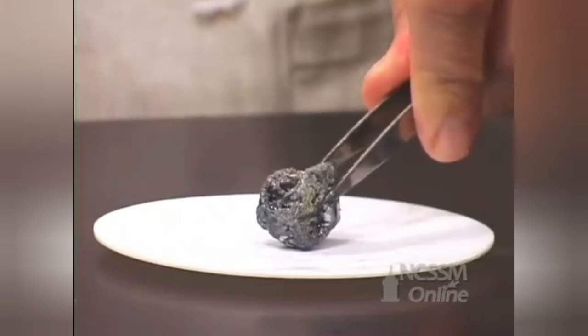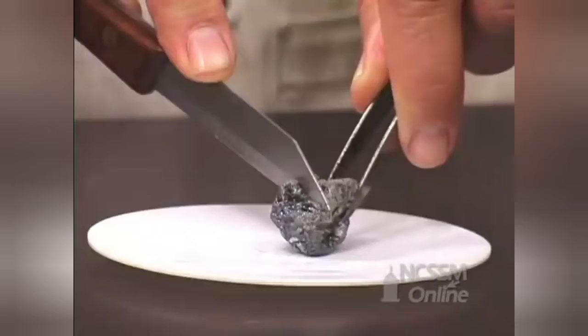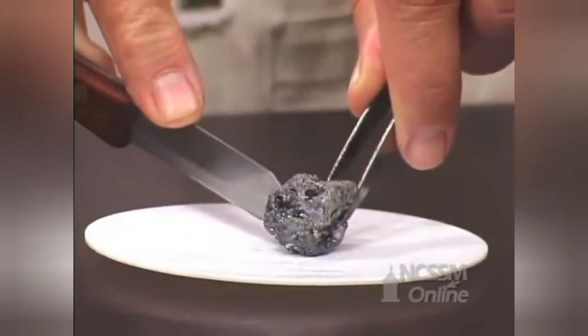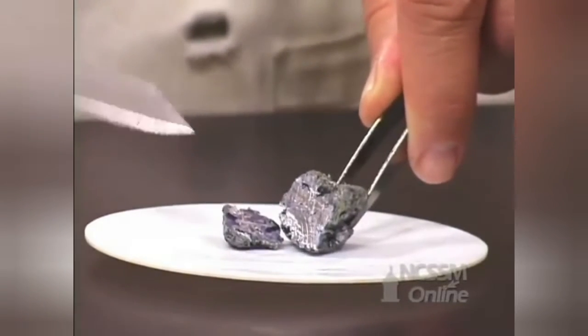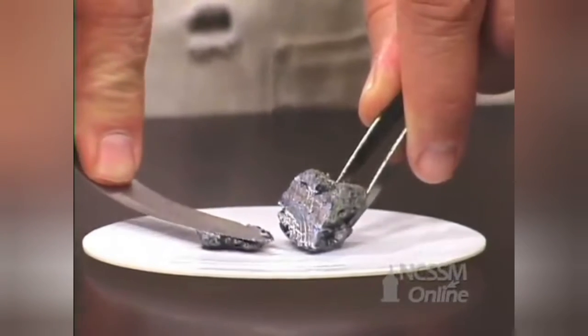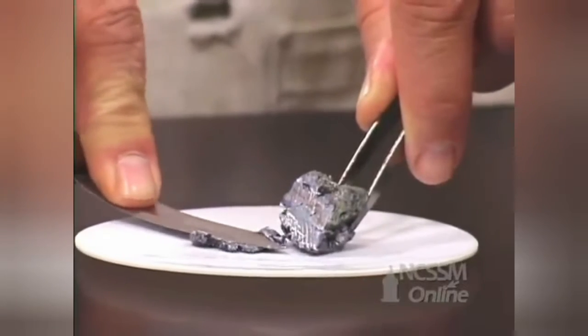On the column, group 1 metals get softer and softer. The potassium cuts very easily. As we cut through the metal, we expose the shiny metal surface underneath. The potassium is extremely soft — we can easily flatten out the potassium metal. It has a consistency of cream cheese.